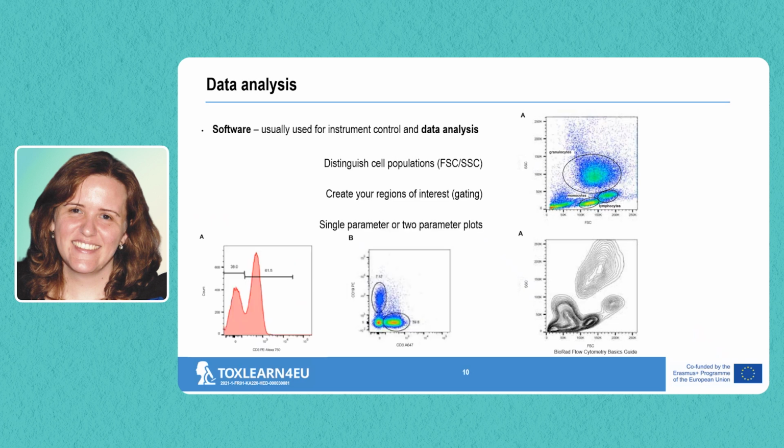And then there is also the possibility to have different kinds of graphs focusing on only one parameter or two parameters. In the case of a single parameter, you will have a histogram like this. You will have the count on the y-axis, and on the x-axis you will have any of the detectors. So you will have here either forward scatter, side scatter, or fluorescence, okay?